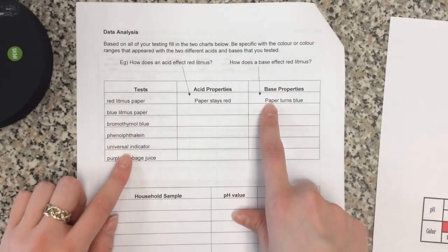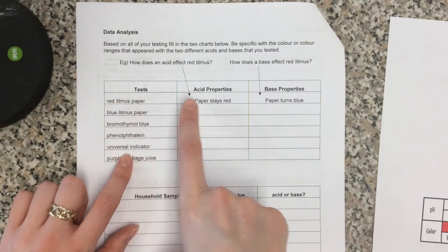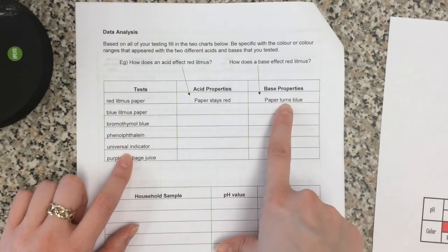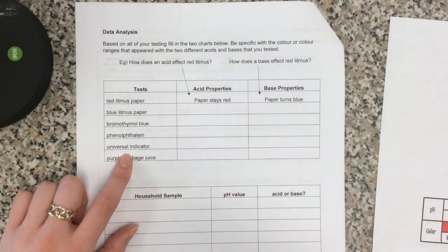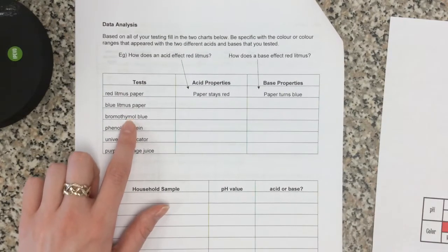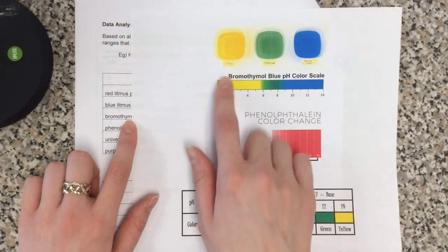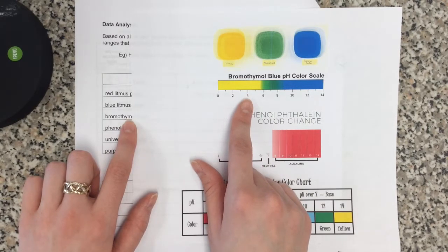So for each of these indicators, I just want you to tell me what color or color range it turns when it's in the presence of an acid or when it's in the presence of a base. So you know that red litmus paper is going to stay red in the presence of an acid, and it's going to turn blue in the presence of a base, right? Blue means base, red means acid in terms of red litmus paper, or blue litmus paper as well. For bromothymol blue, you're going to want to look here and find that indicator scale and tell me what color it turns when it's an acid versus what color it turns as a base.